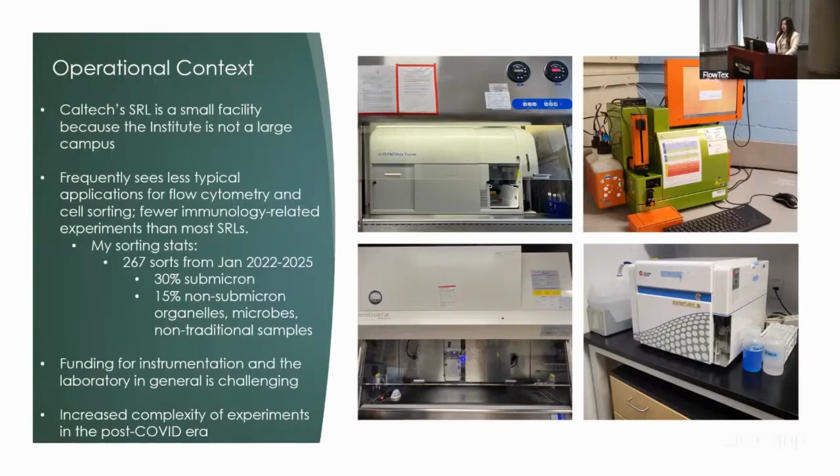And then of course, beyond time and patience, there is the economic reality that purchasing a new cell sorter is a costly risk that many individual labs and SRLs simply can't take. We did purchase a new instrument, but it's not pictured here because I know there's a lot of clinical folks out here, and we protect the identity of the patient in any good case study, right?